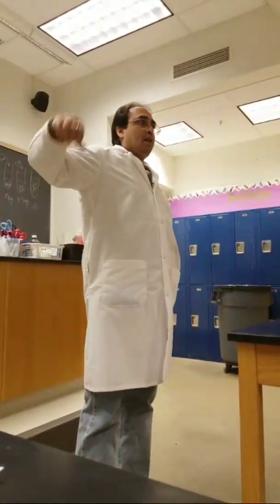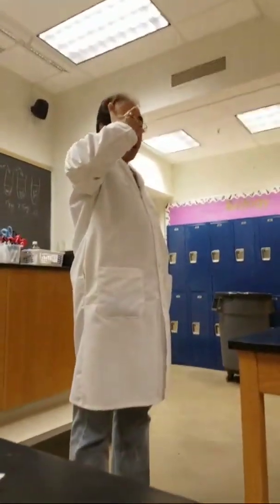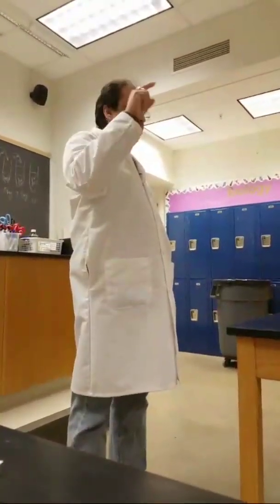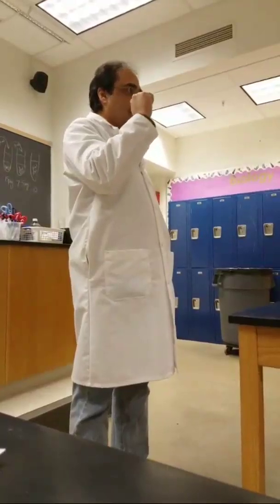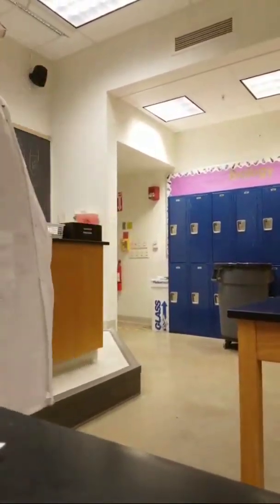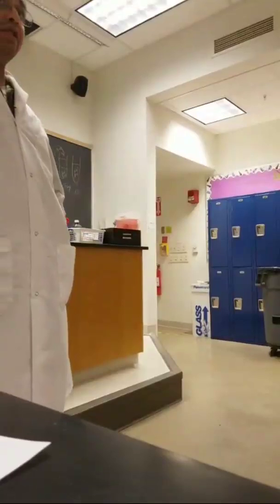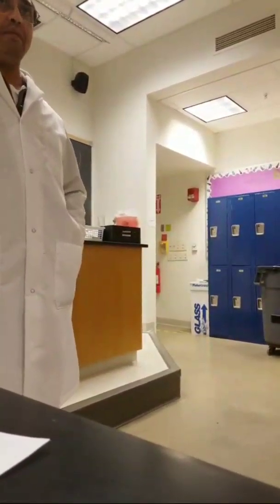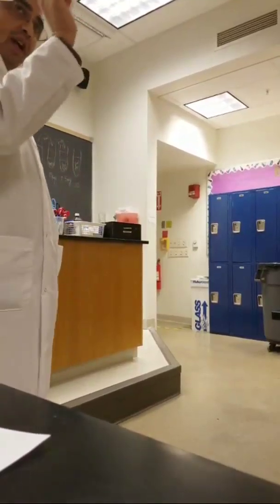From there you need to find the concentration of the unknown solution. You need to take the reading of the unknown solution, put that into the equation and find out the concentration. I will not tell you what kind of standard curve this is. Everything will be written there. You need to find out the unit and everything from the graph. You need not do the standard curve, but the unit should be there. Suppose it is microgram per ml, the concentration should be written as microgram per ml or mg per ml, whatever it is. But you need to find out the unit also.